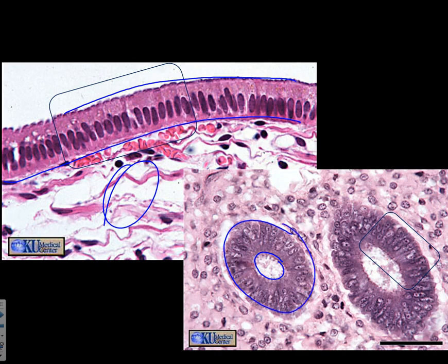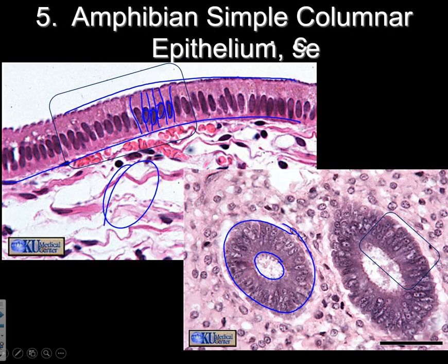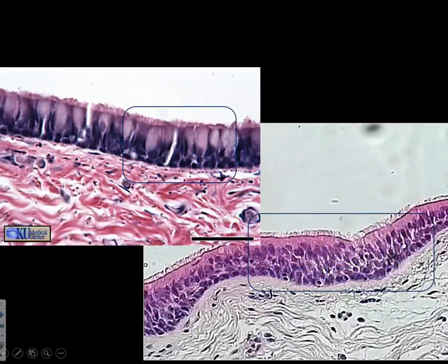And we can see these tissues, guys, pretty clear. Column-shaped cells with pretty equal nuclei right in the middle. So this, my friends, is simple columnar, one layer of columnar cells. Same thing down here, a little bit harder to tell in this image. But we have simple columnar.